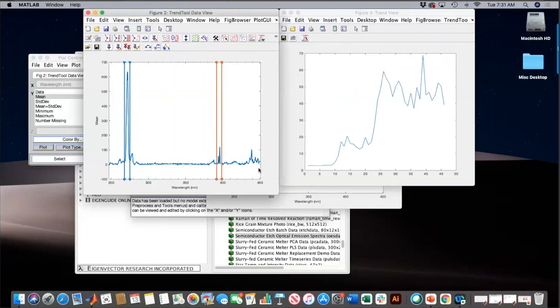And so now that's a ratio, yeah, that's a ratio of this one to that one. Correct. Yep. And any other markers that you generate on this plot will then be ratioed to the red set. Got it. So there's the ratio question answered. Okay. We had another one come up. Can area values be exported as a table or text?